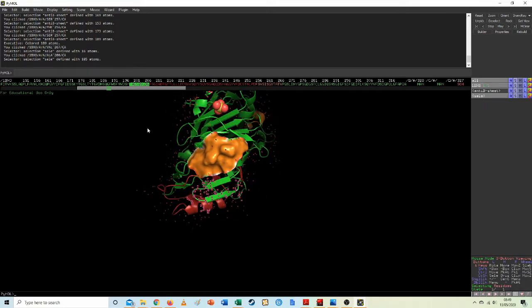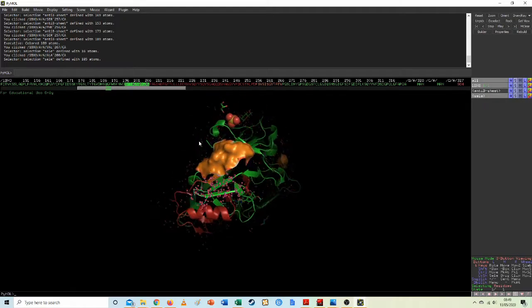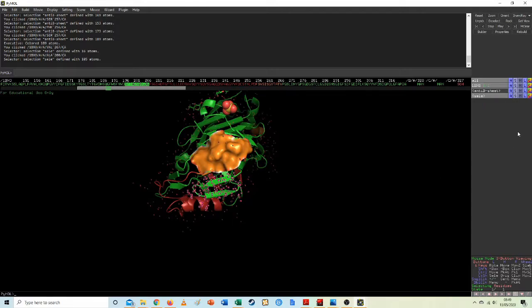A little bit tricky. As much as this is tricky, it is fun, I would say. So, now I've got this other section. I'm just gonna label it something slightly different. So, this is the anti-beta sheet 2.